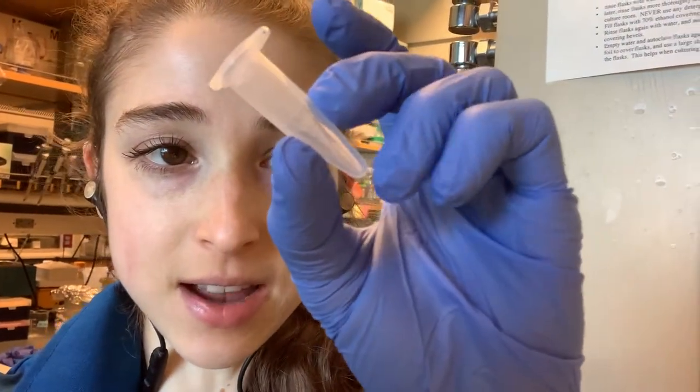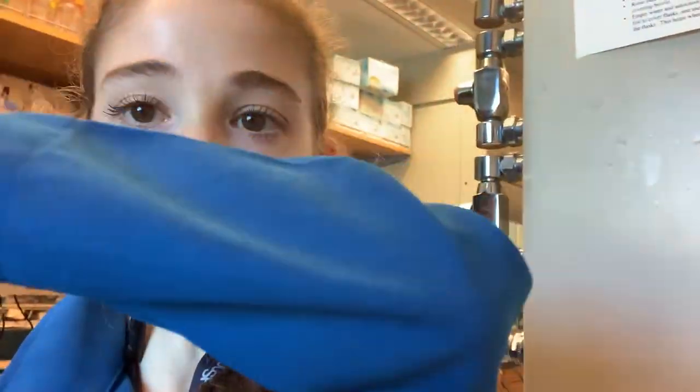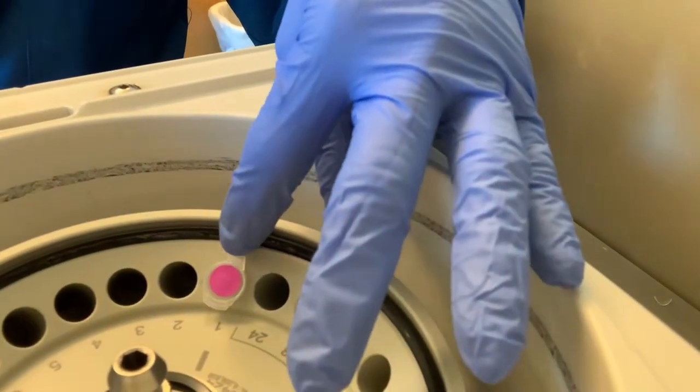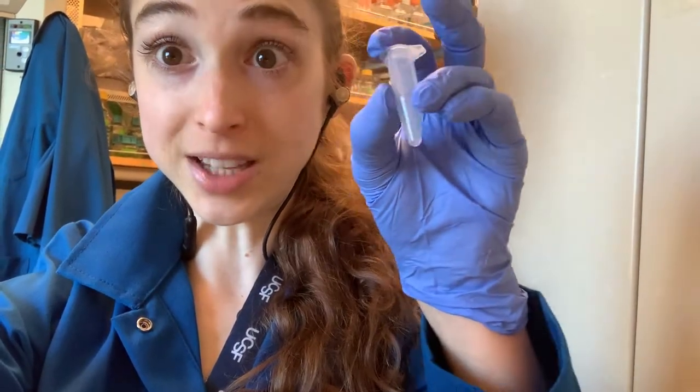Going back to centrifugal force — when force is applied, the pellet is going to form at the outermost bottom of the tube. So if you're pelleting something, especially a really small pellet like precipitated RNA or DNA, you want to know where that pellet is so you don't accidentally aspirate it. I like to always load tubes in the same orientation so that the hinge is at the top. That way, when I take the tube out, I know the pellet is directly below that hinge. You can also mark it on the outside of the tube.